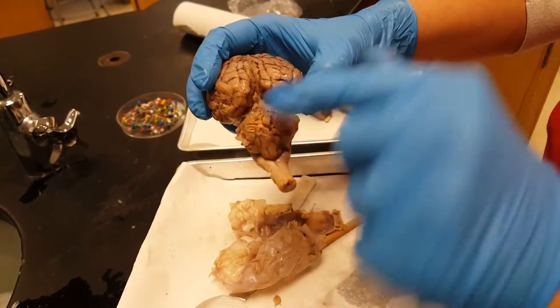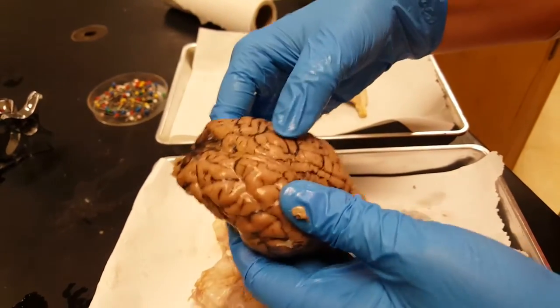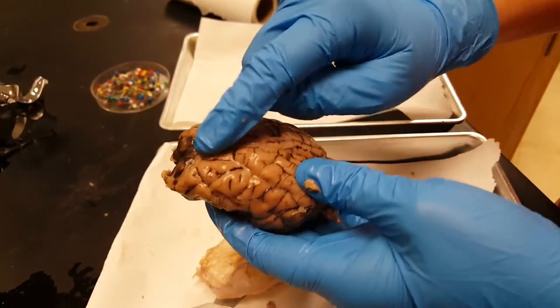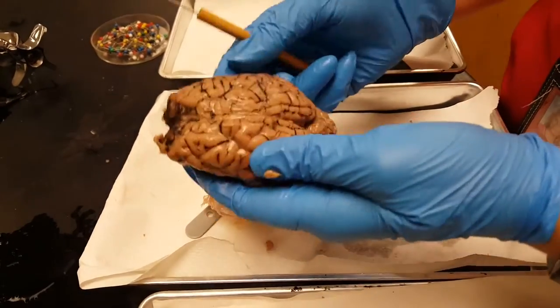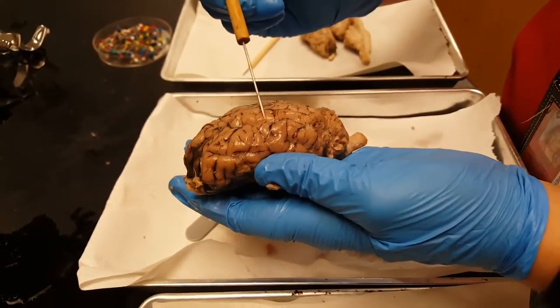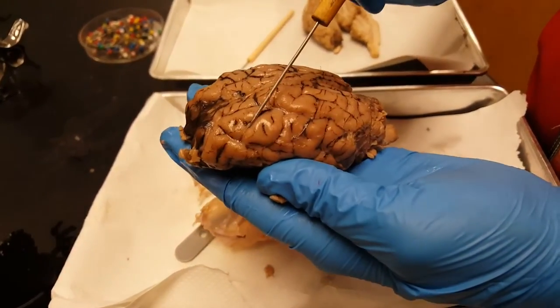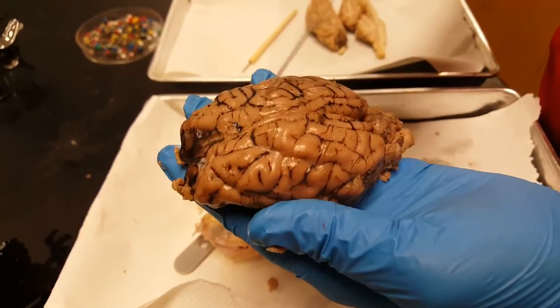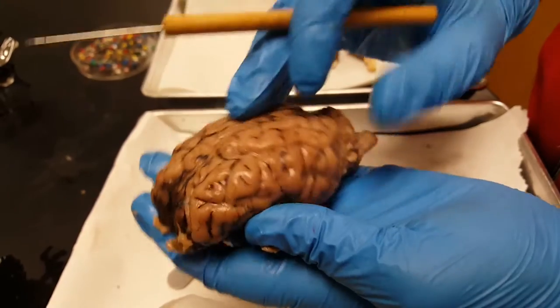This opening between the two is the transverse fissure. Eventually you're going to cut it down the longitudinal fissure, but for now we're going to identify features from the external anatomy of the brain. The wrinkles of the brain — the raised parts are called the gyrus, and the indented parts are the sulcus. That black stuff is just from where the blood coagulated.